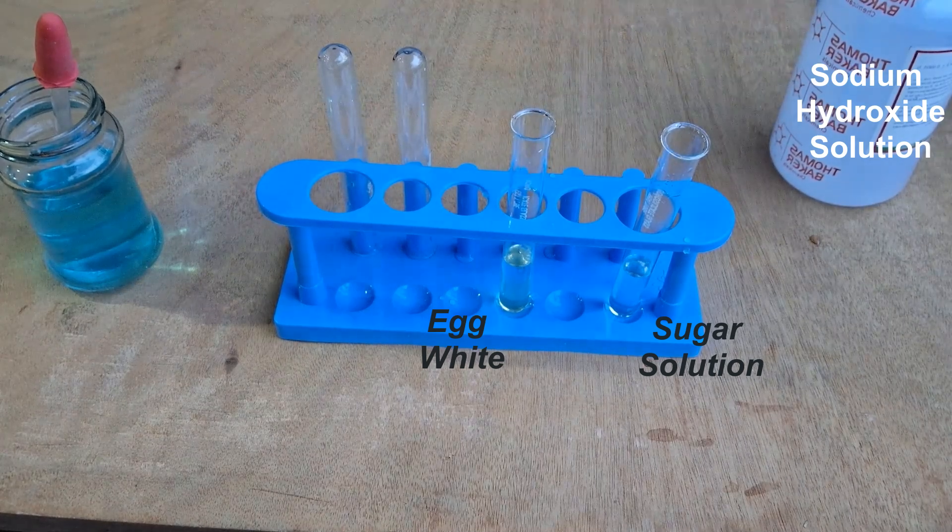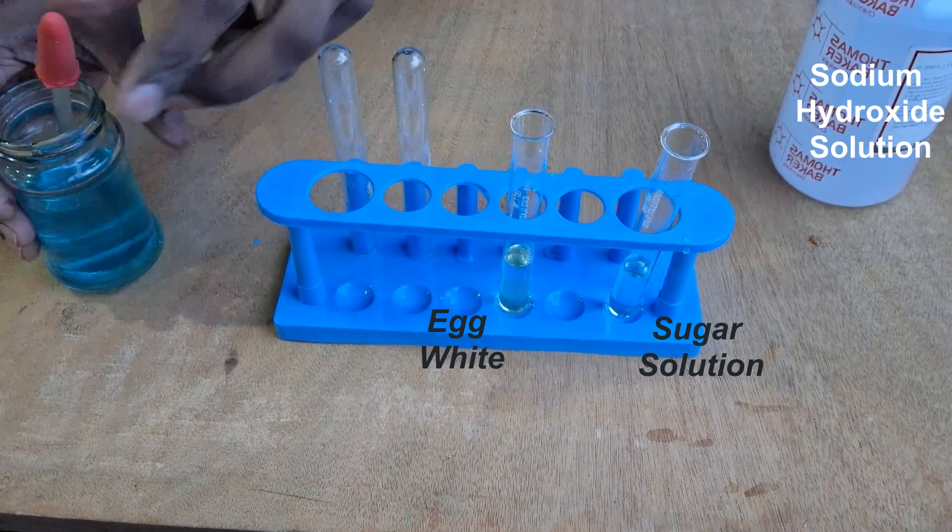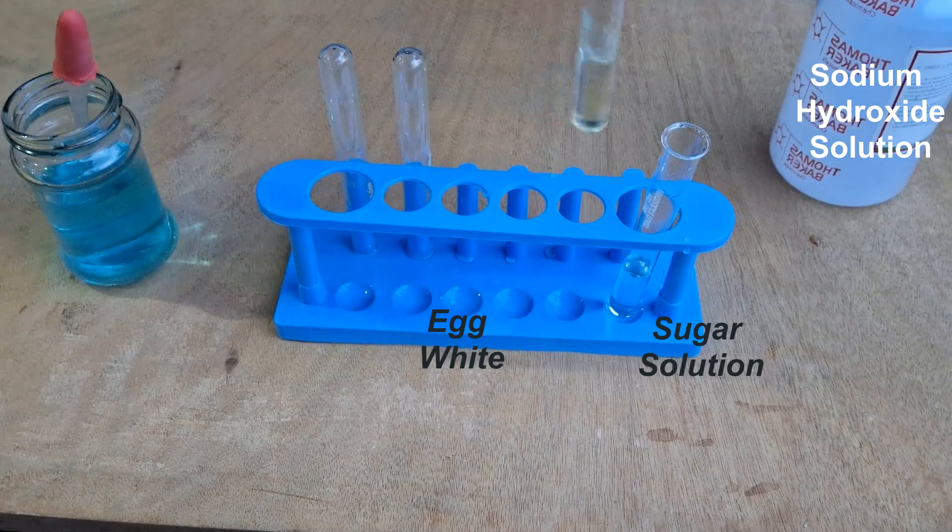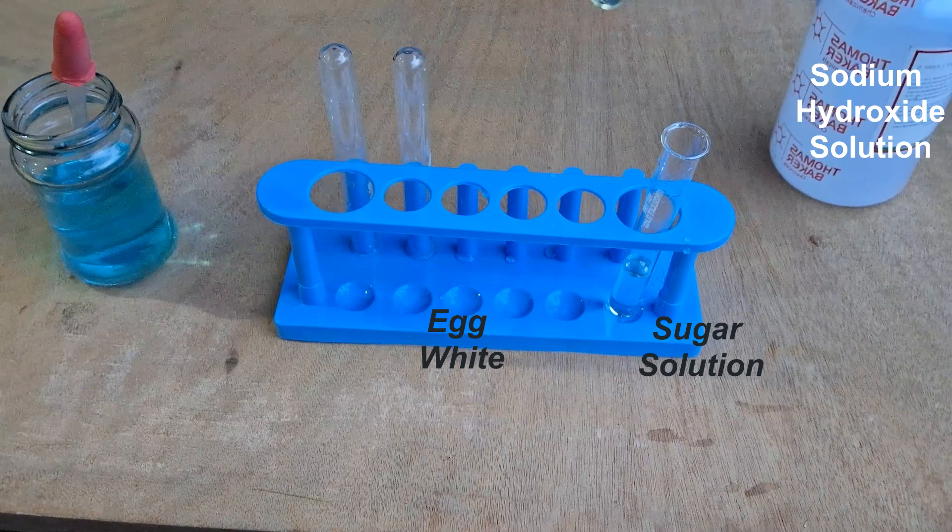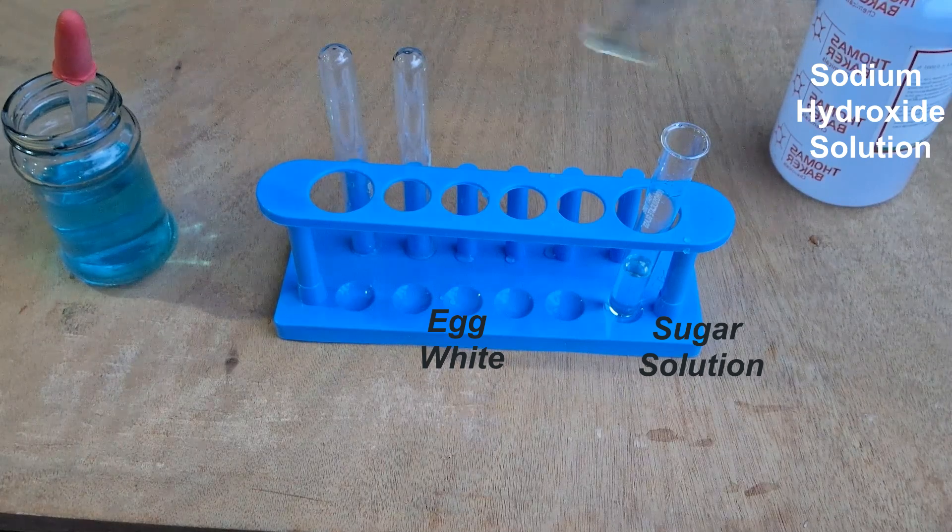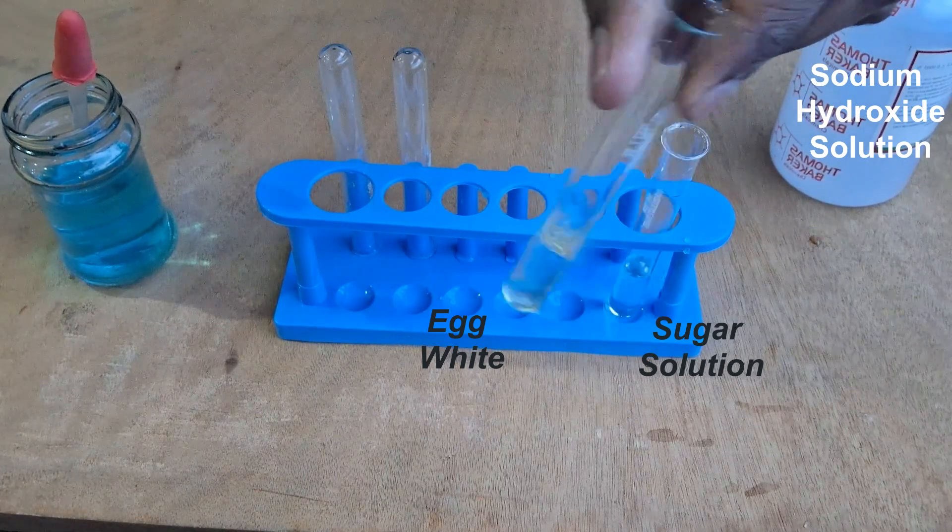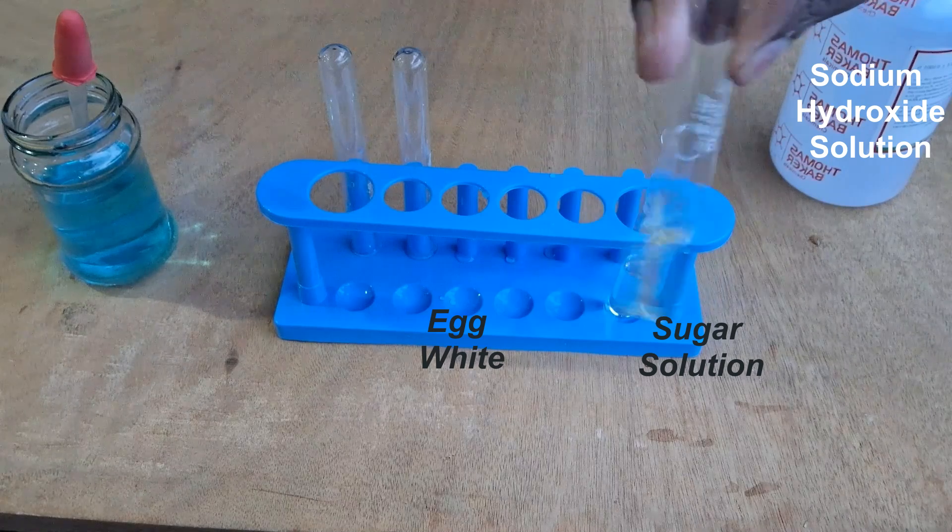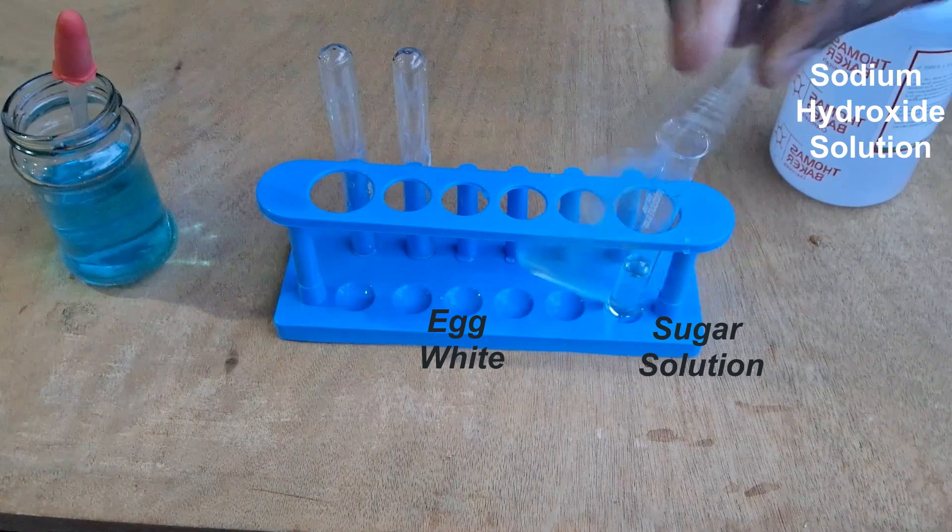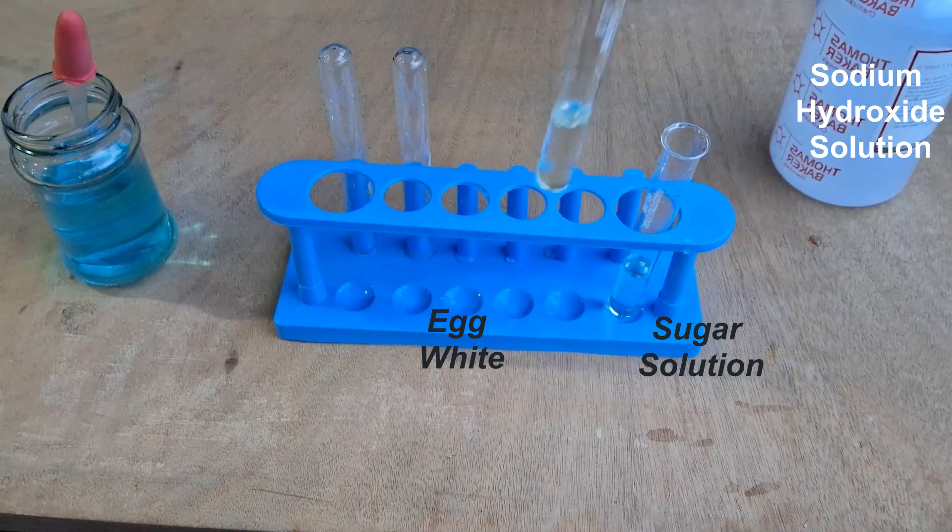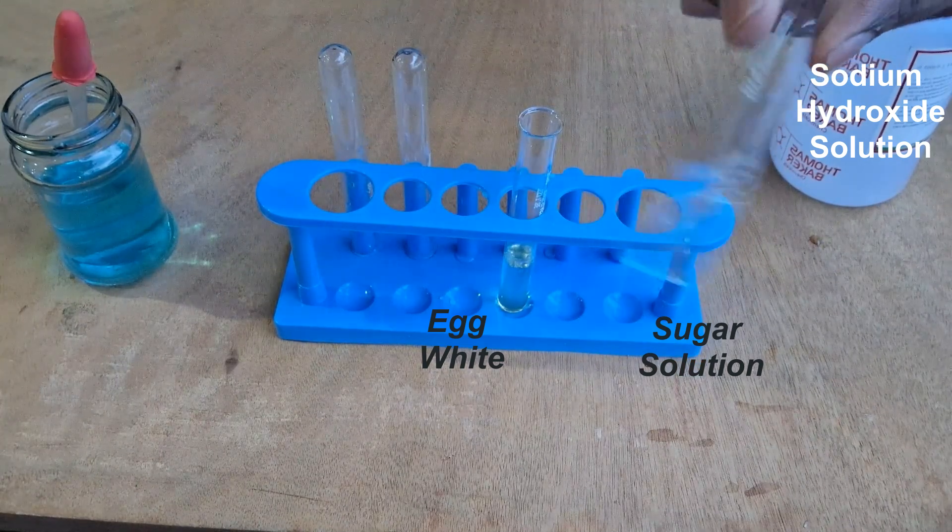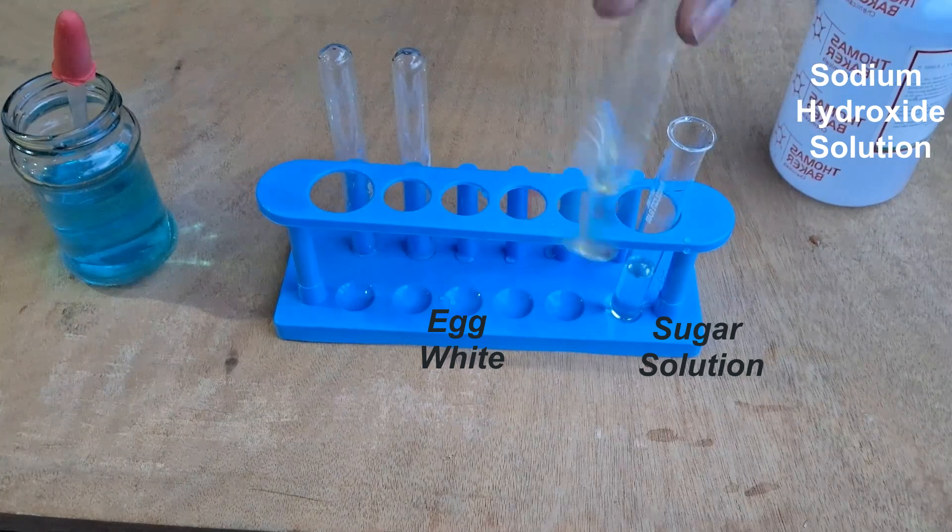Now we'll take the test tube and swirl it about, shake it a little bit so that all the sodium hydroxide gets mixed up with the egg white. I'm doing this because the egg white is a little stiff and doesn't easily mix with the sodium hydroxide unless it's shaken about. We'll do the same thing with sugar to make sure it mixes as well.